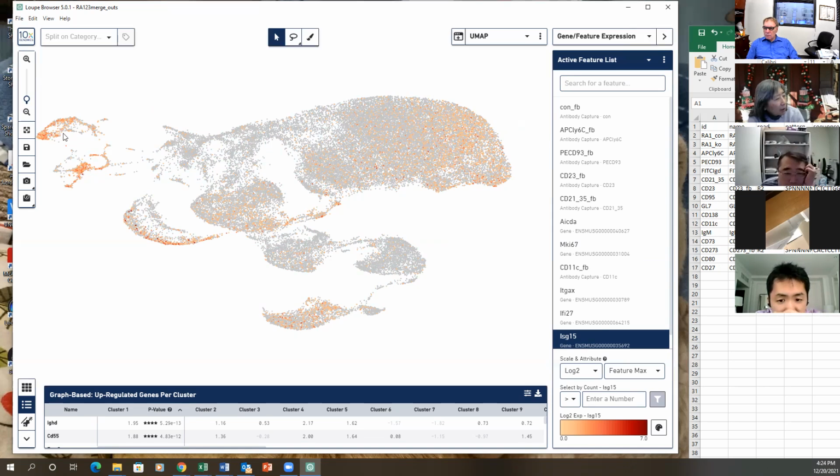Plasma cell. So this is kind of like my wild type mice, right? That means maybe it works for my cases also. I think at least this strategy works quite well.